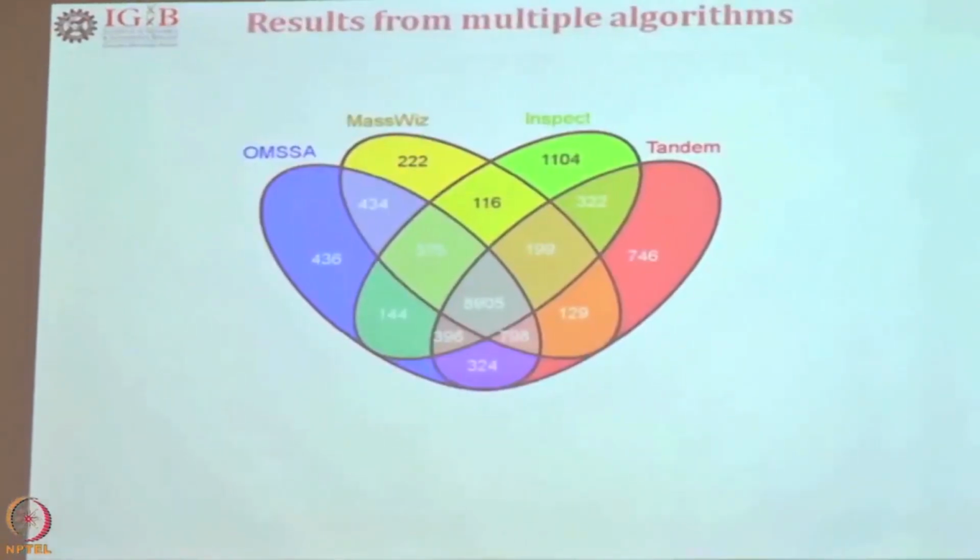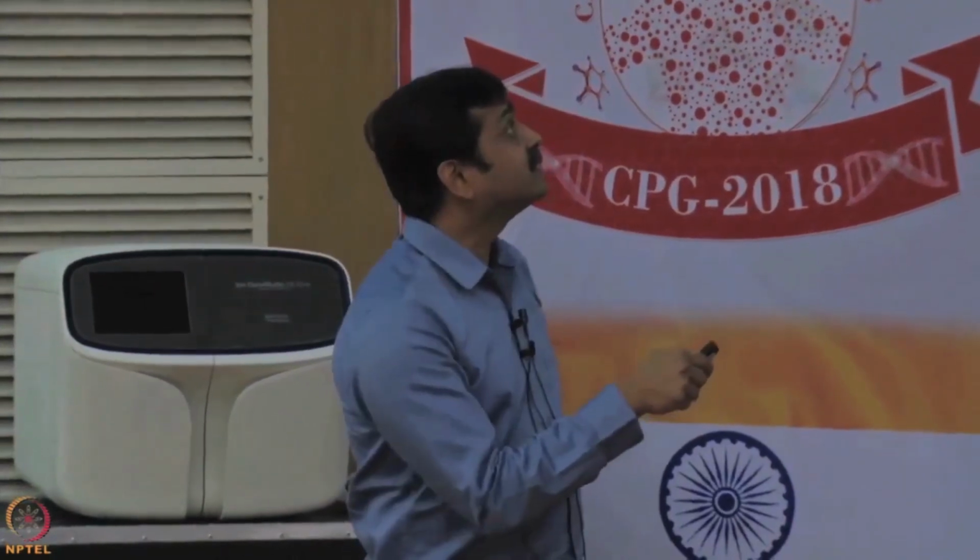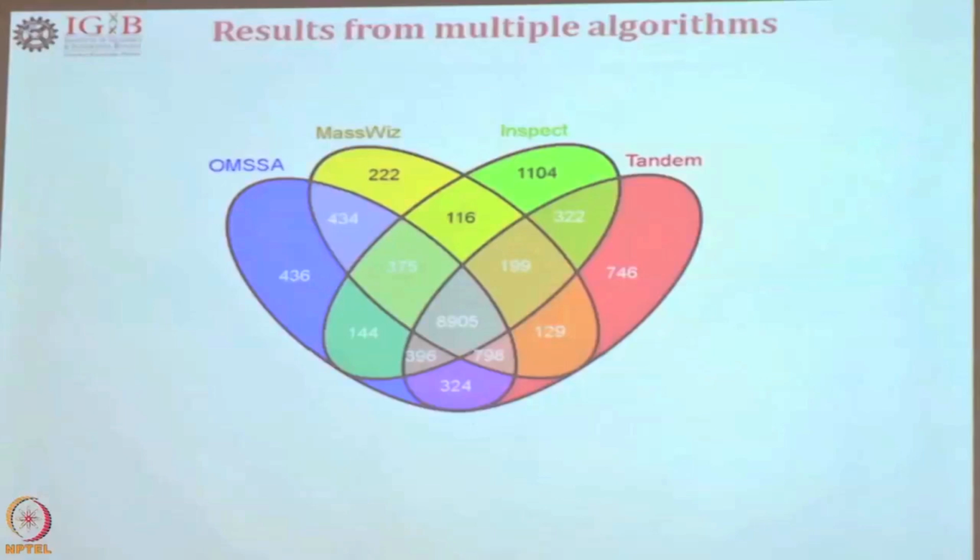Another question coming your way. Now, world is not that simple to me. All search engines gave different results. Now, what do I do? Whom do I trust? What do you do if you get results like this? Same experiment, same database, search parameters being same, the search engines are giving you different results. And you are a PhD student and you have to take a call now.